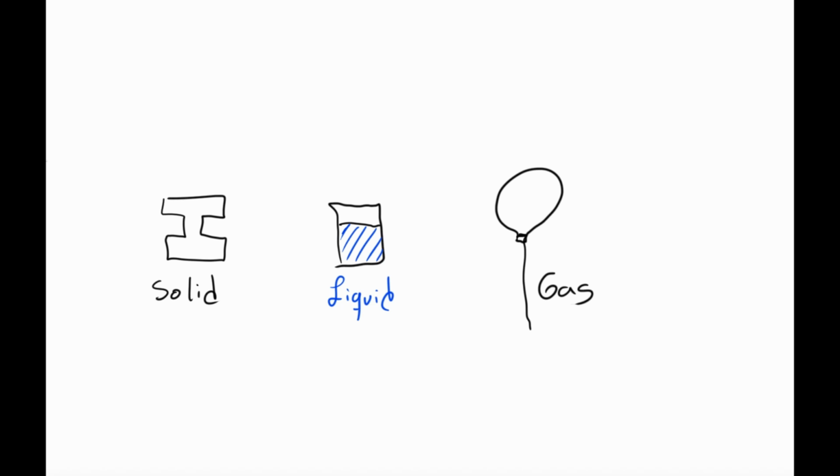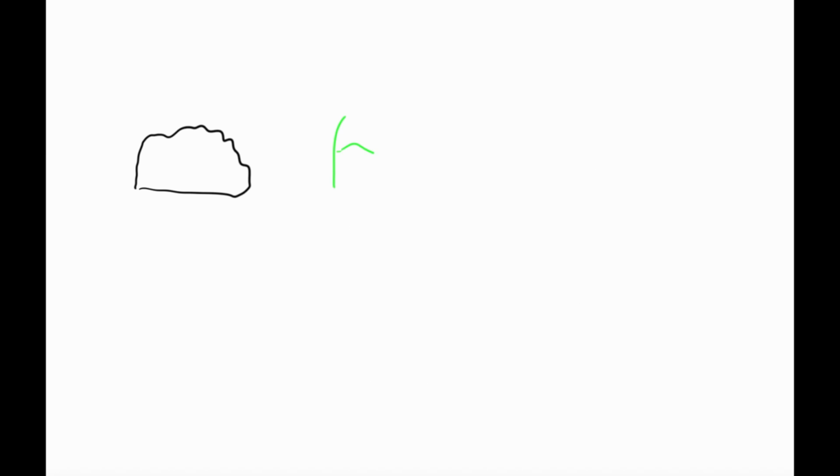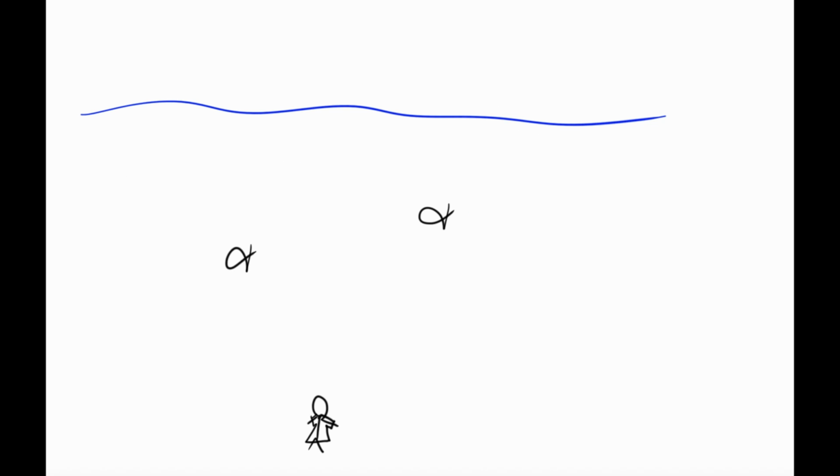This makes it an ideal technique for on-site analysis of rocks, glasses, metals, sand, teeth, bones, weapons, powders, hazards, liquids, plants, biological material, and even polymers. LIBS can be performed at atmospheric pressure, in a vacuum, or even on other planets.